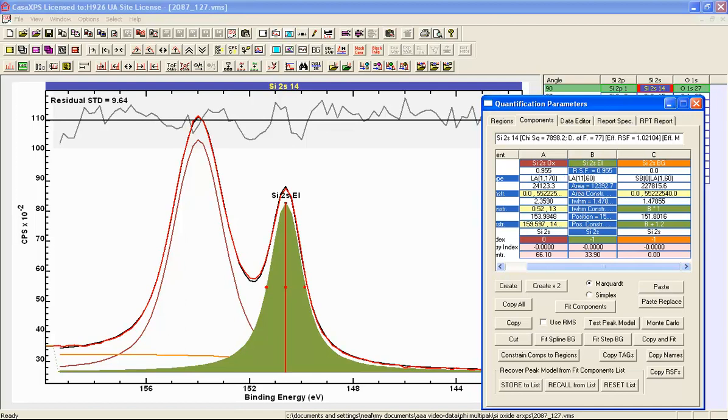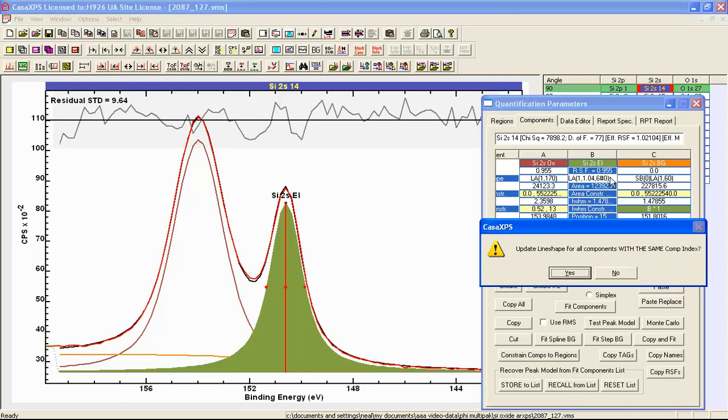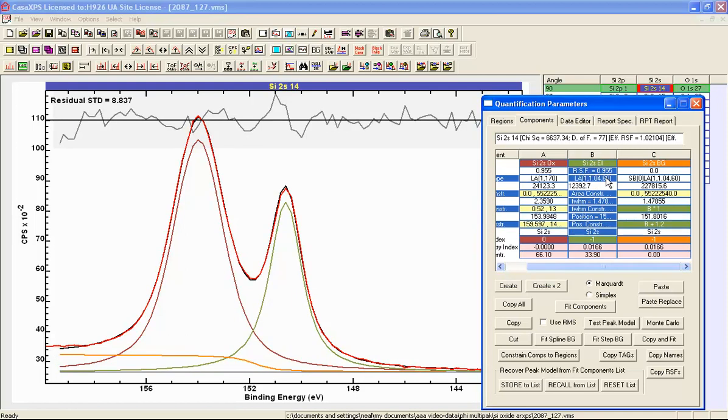So if I say 1.04, this represents a parameter that will act on the right hand side of the peak model. So the Lorentzian on the right hand side will have a different suppression to the Lorentzian that will be available to the left hand side. And if I again say hash, the same line shape applies to both, slightly different fit, and we end up with an even better fit to these data.